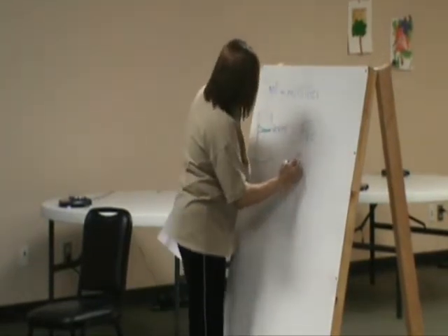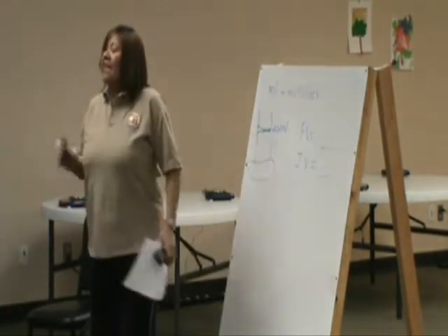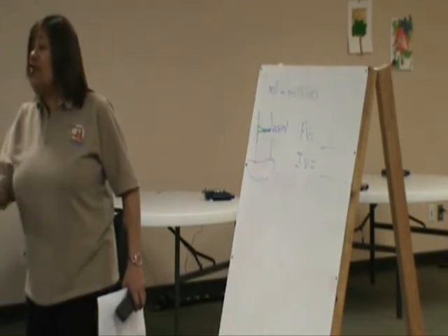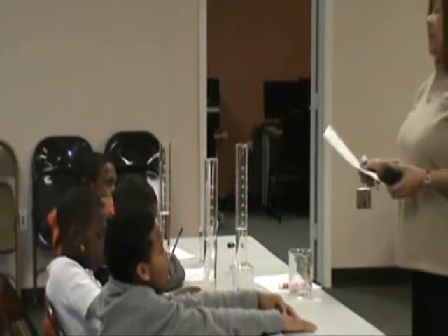Very good. That means y'all are looking at your paper. Now, at this time, we are at the beginning, so I want you to record your data for the initial volume of water. Your initial volume should all be what, class? 250. Now, guess what?